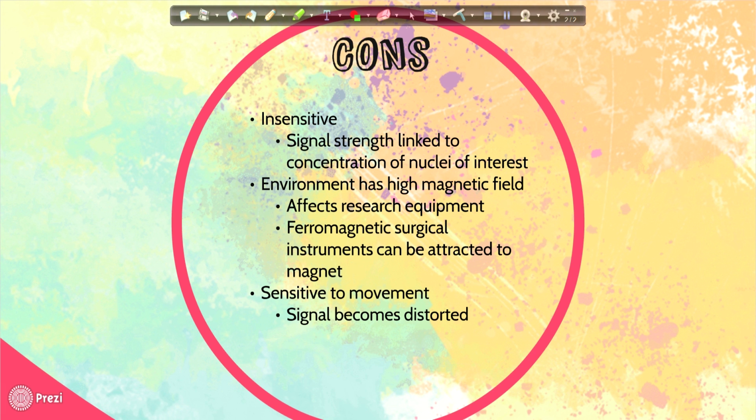While there are no known risks to human health from doing so, this can adversely affect the functioning of electronic equipment, such as computers, that are used in the study. Objects made of magnetic material may also become attracted to the magnet and thus pose a safety hazard.